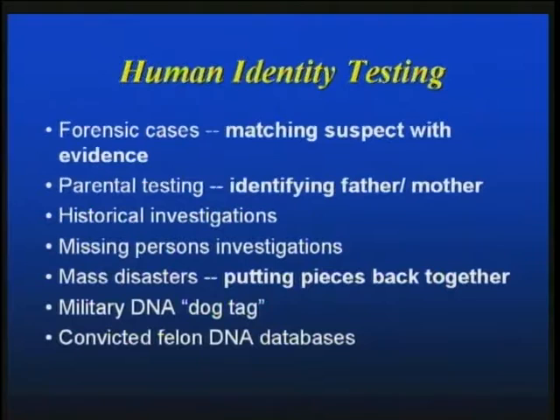So I'm going to be talking about the technologies that we use for engraftment monitoring. I'd like to start by saying that the technologies that we do use for engraftment monitoring are actually a segue from what has traditionally been used in forensic medicine for human identity testing. And as you can imagine, there are a lot of indications for human identity testing, and I've listed a few of them in this particular slide.